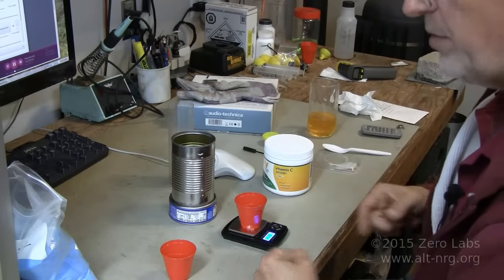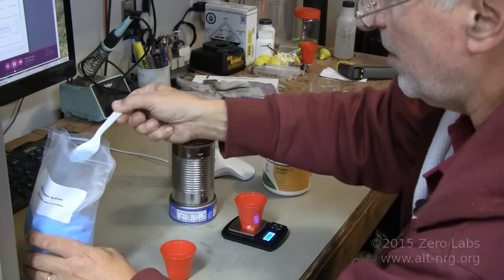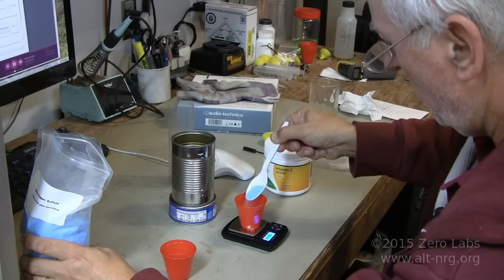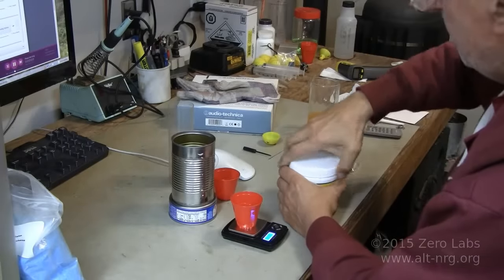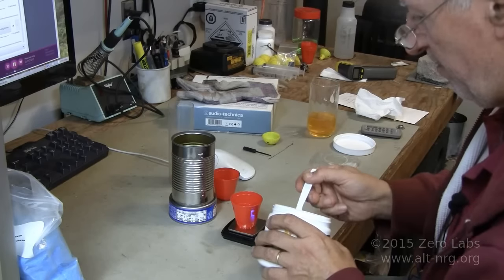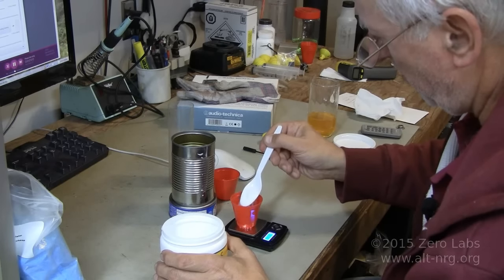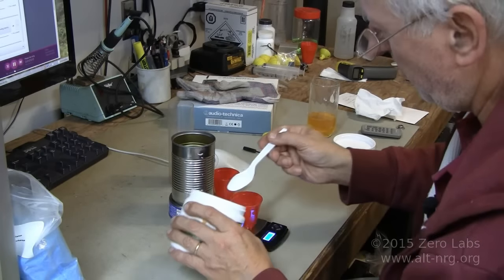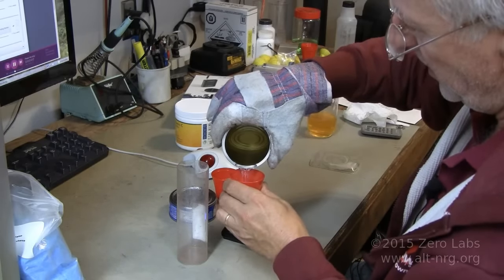So I tare my scale with the cup on it. I'm going to measure out about 2 grams. Last time I tried 1 gram, it wasn't enough. So I'm going to measure out 2 grams of copper sulfate. Now I'm going to measure out 10 grams of ascorbic acid. I keep screwing that up. Last time I only measured out 5 grams, and that wasn't enough to make a saturated solution. One of these days I'm going to get myself some real scientific glassware.